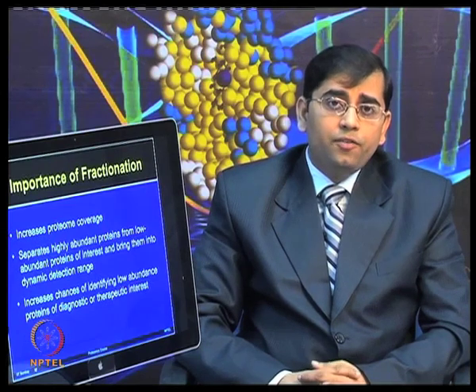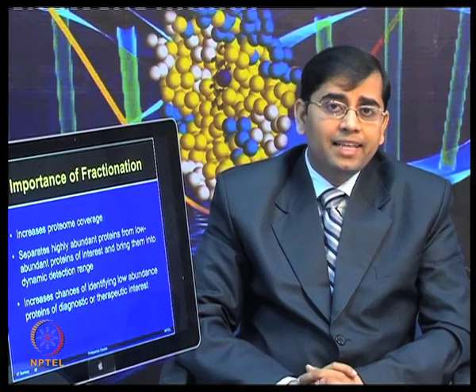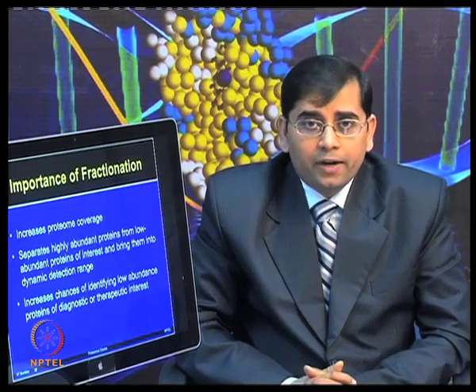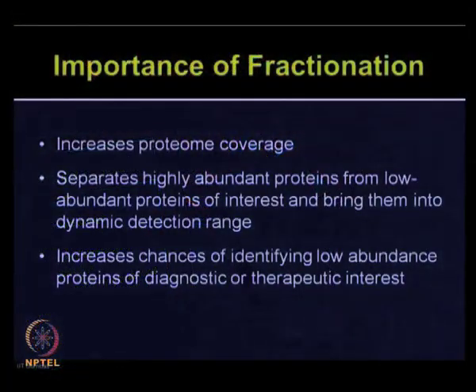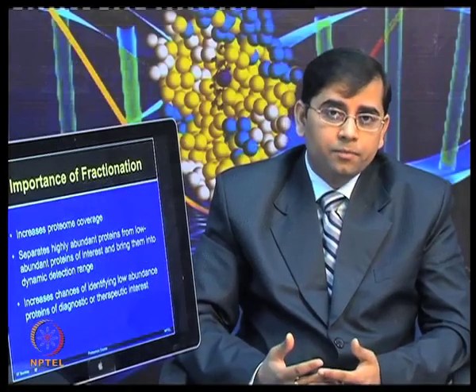So, we have talked about different fractionation strategies. Now, what is the significance of fractionation methods? The first and most important thing is that you would like to increase the proteome coverage. You would like to analyze as many proteins as possible from that given sample. An effective fractionation method separates highly abundant proteins from the low abundant proteins of interest and brings them into the dynamic detection range.